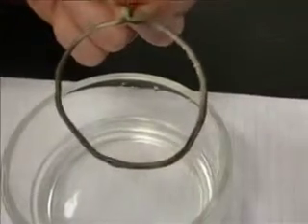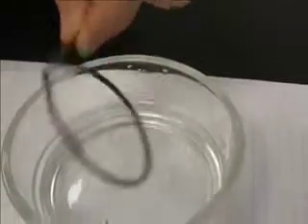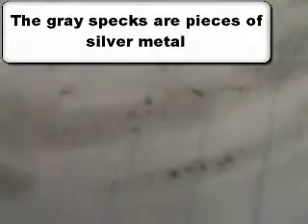Ooh, you can see really well there on the back side. That's pretty cool. Mr. Sams, why don't you put that on that little piece of paper maybe, and I bet it'll flake off. Just tap it. Some of our silver metal there on the paper. Chunks of silver.